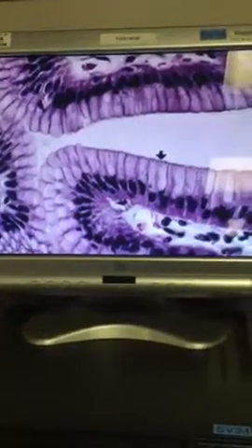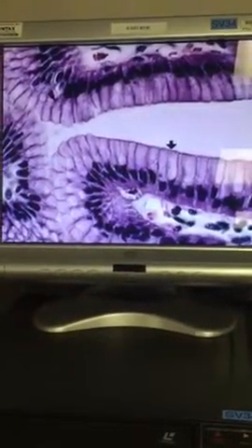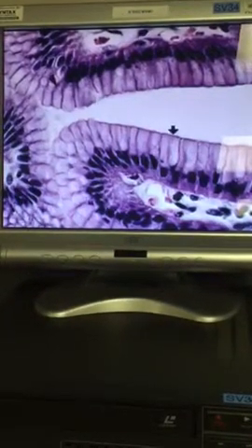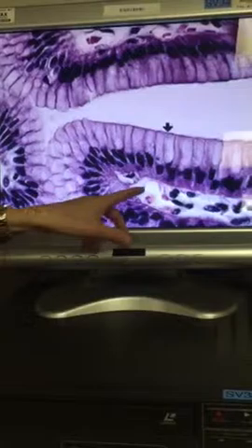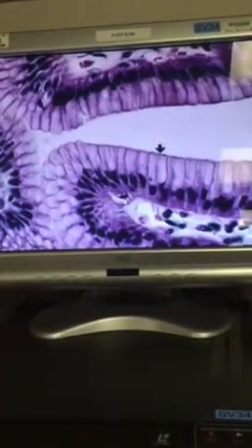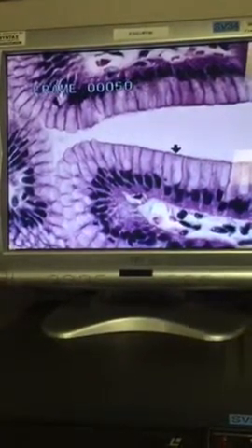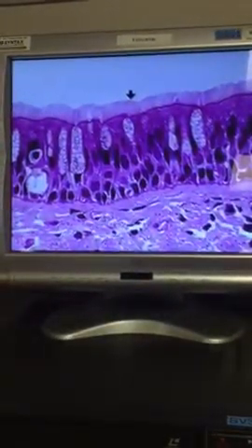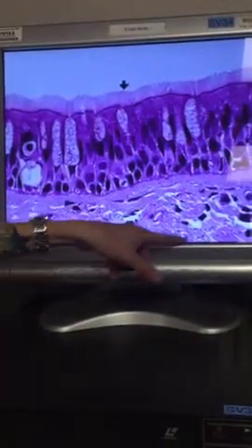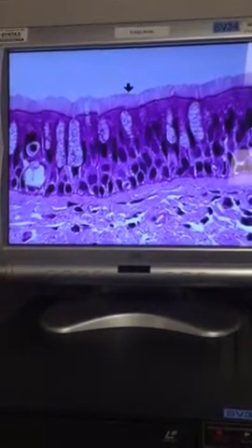What is the tissue underneath the basement membrane? This actually is loose connective tissue. It's areolar. And it kind of looks like it, right? You see what looks like some fibers here, but not a lot of fibers. That is areolar. And areolar is really common. It actually is usually found underlying epithelium pretty much everywhere. This looks more like a dense irregular, but it might be areolar. Sometimes it's kind of hard to tell.